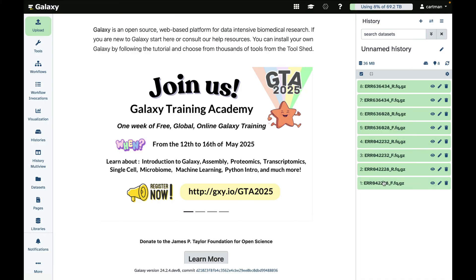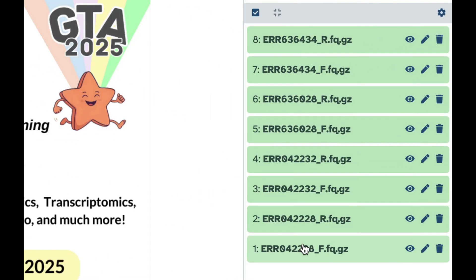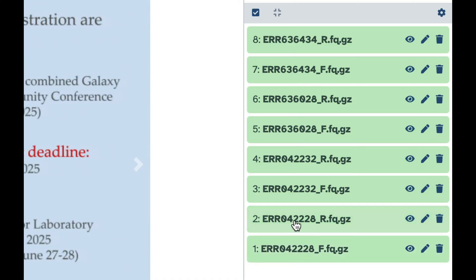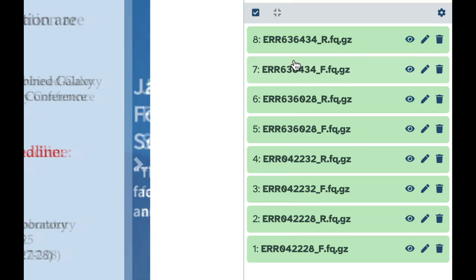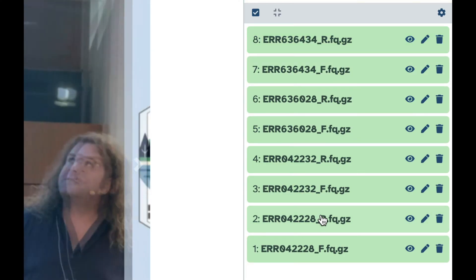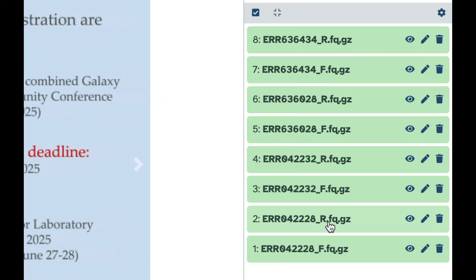So here we have four samples. Well, there are actually eight data sets because it's paired-end data. So you can see this is sample one, this is sample two, this is sample three, this is sample four. And the only thing that sets them apart is these F or R's. F stands for forward reads, R stands for reverse reads.